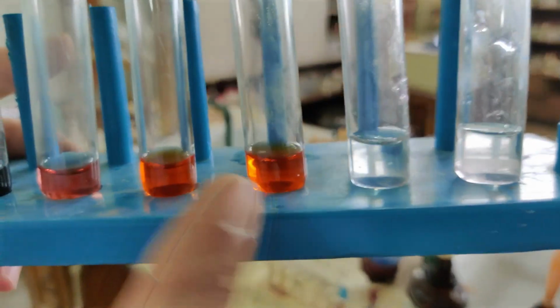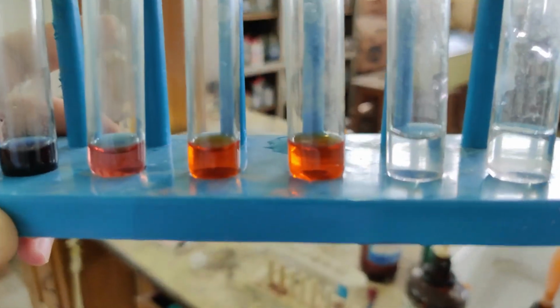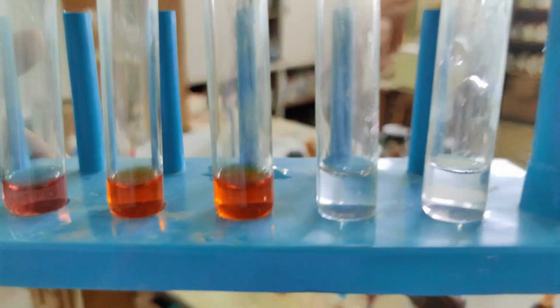Then the next 2 test tubes both contain the same solution, and both of these are methyl orange. So as you can see, they are orange in color. And why have I put in 2 test tubes? Because one I want to test with acid, the other one I want to test with base, and you will see what color changes will take place in both of these.